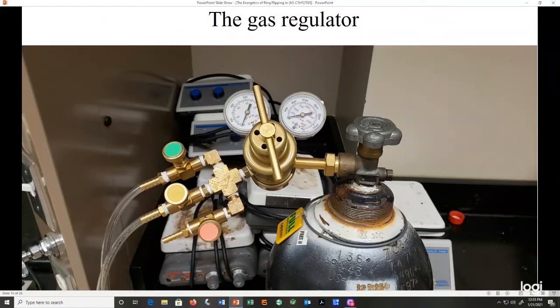First, we have a 2-stage regulator that's going to be used to supply our nitrogen gas. The gauge on the right is telling us what the total pressure inside the tank is. And this 2-stage regulator has a second gauge which tells us how much pressure we're actually letting exit the system, and that can be controlled with this valve. And we have 2 lines going out. This one is going to our gas manifold, and this one is going to our purge needle.